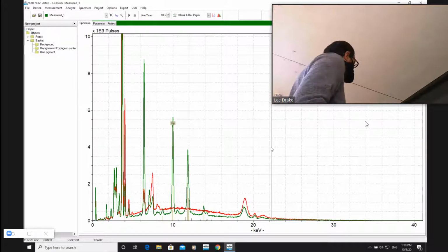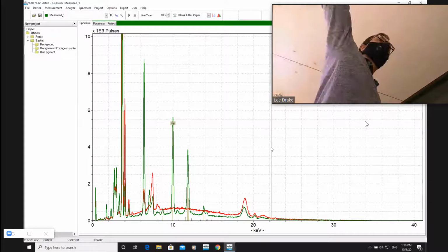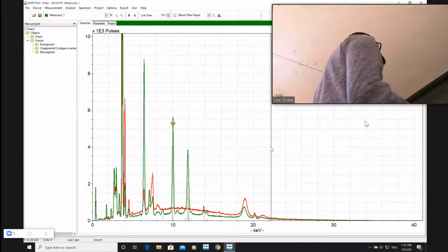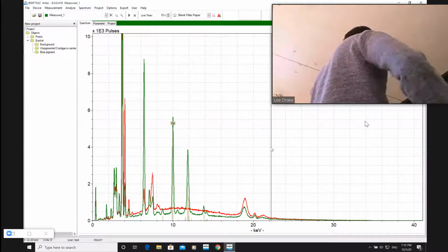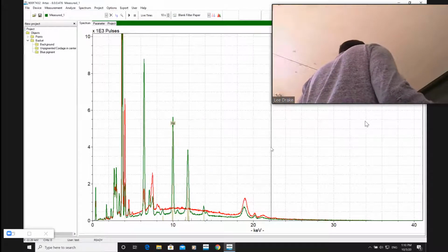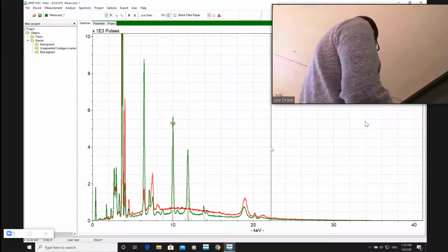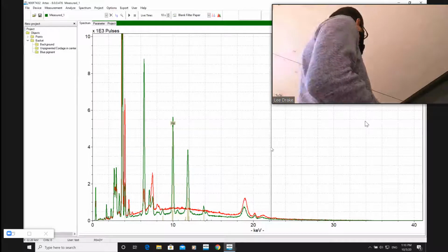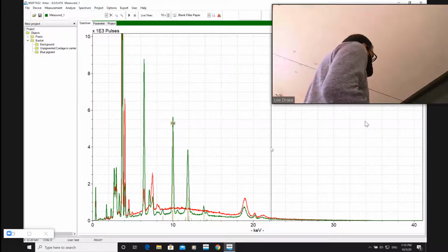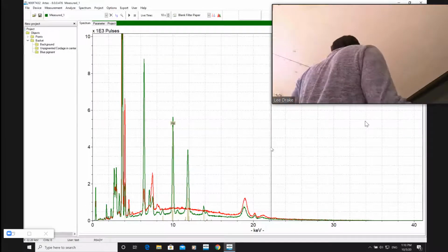So what you do with microfading is you take a small sub-millimeter portion of this, and you blast it with the equivalent of the light it's going to experience for 100 years. Then you can look at the fading and quantify that this thing can be on display for 90 years in standard museum lighting before this pigment is gone, before it's ruined. So if you want to go crazy with future grants, that would be something you could do. You could figure out the budget for this mercury sulfide under ambient lighting conditions, and that will help guide you in how to store it. That said, storing it in the dark is always going to be the right answer.